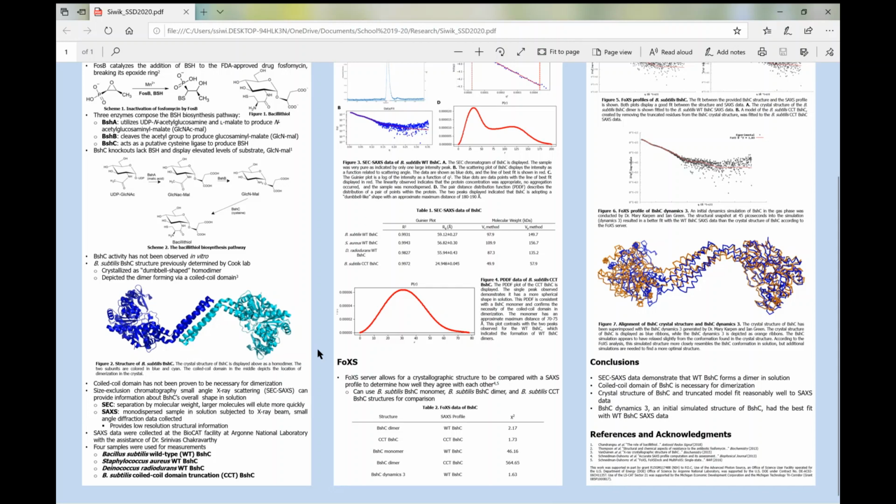So because you can't really study the activity of BshC, we look to further explore its structure and answer some more questions about that. And so there were really two questions that we wanted to ask. One was that, does BshC truly form a dimer in solution?